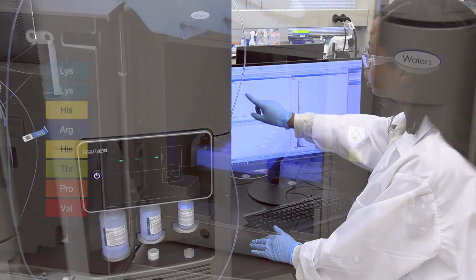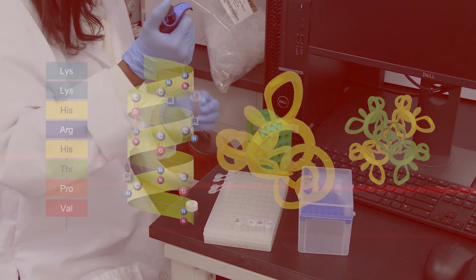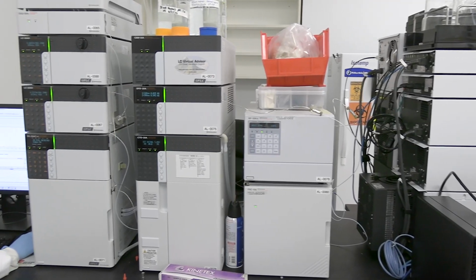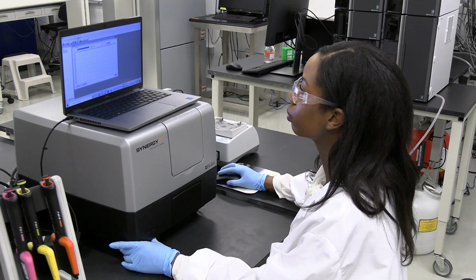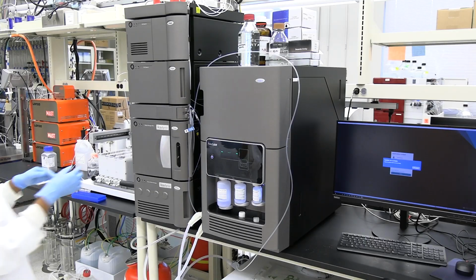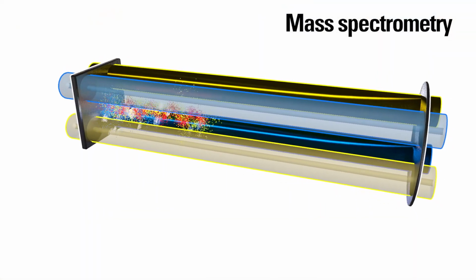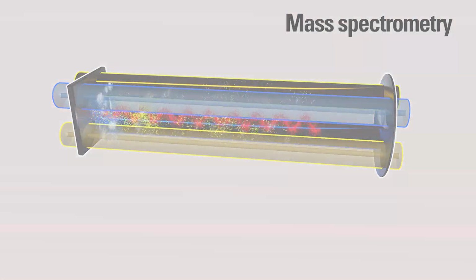So characterization is important not only from the primary structure level, amino acid sequences, but even to higher order structure and conformation. Popular or mainstream methods a lot of times can be broadly categorized under chromatography, spectrophotometric, or electrophoretic techniques. But in the most recent years, the technological evolution of mass spectrometry has made it a significant asset in biotechnology.